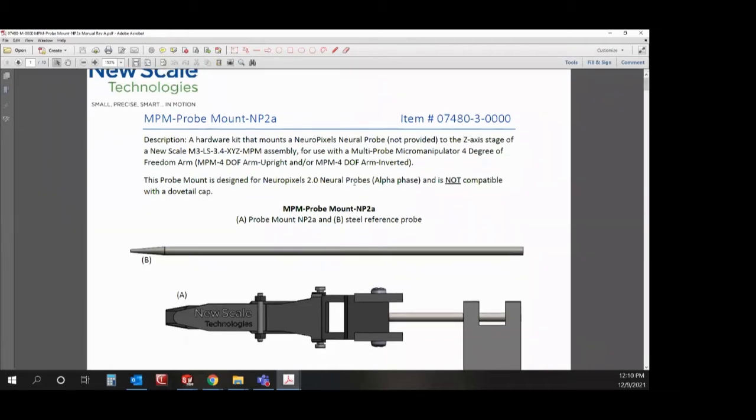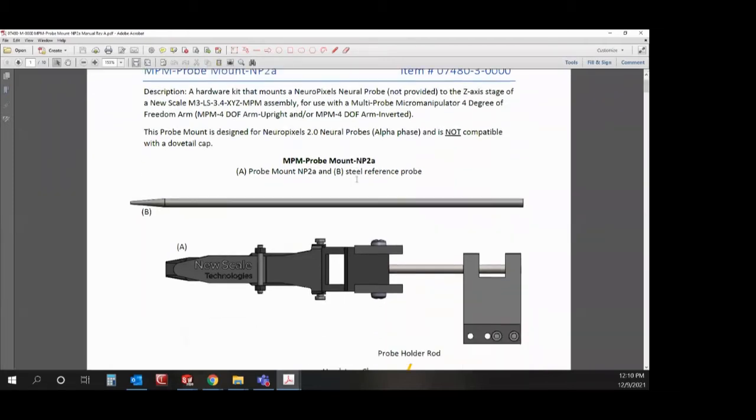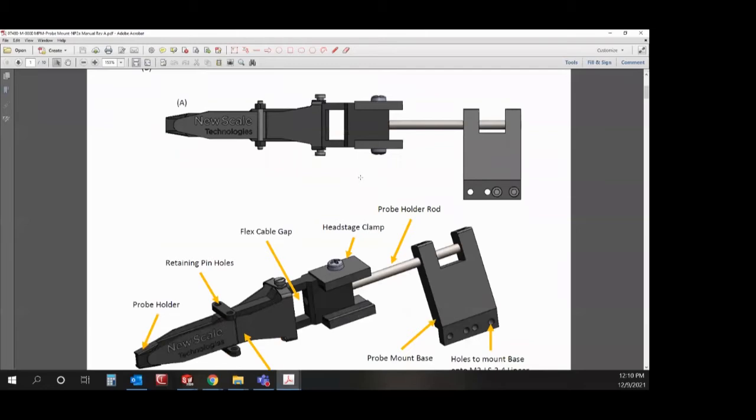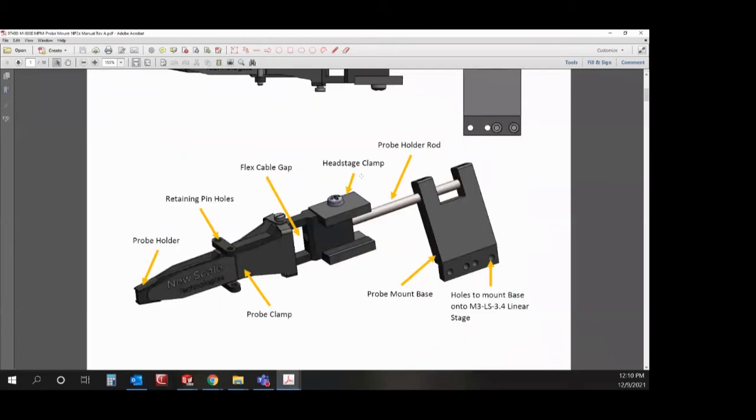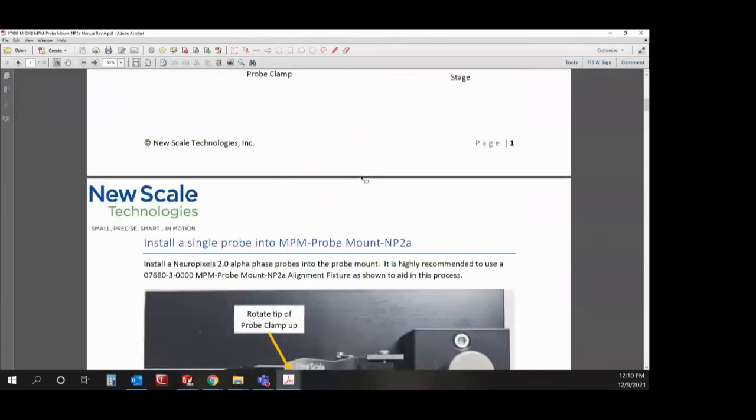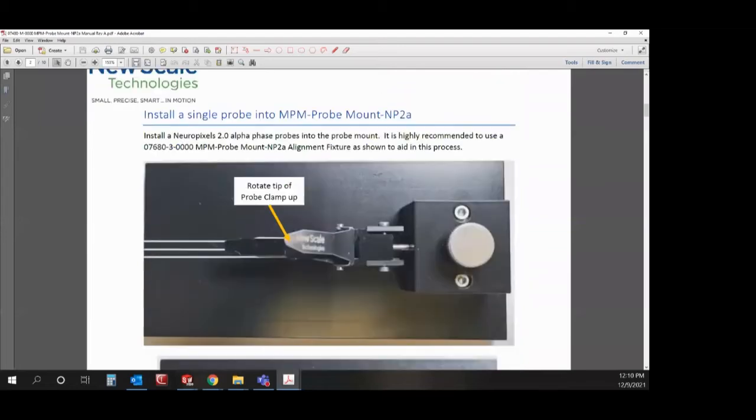This manual is available on our website. You can contact us directly. We can email it to you if needed as well. It describes how to install the probes and install the probe mount onto our stages.